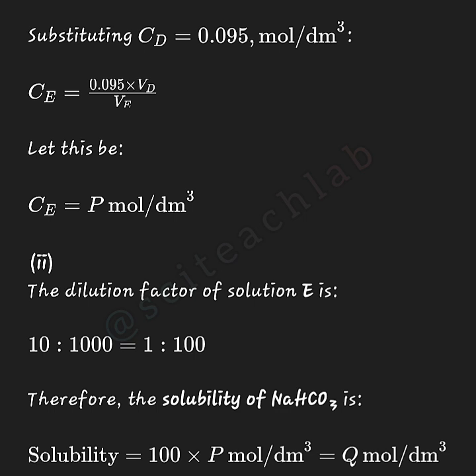Okay, your volume of acid from your average is going to be different, and the concentration may be different from the one you will use, but whatever you use, when you calculate your average, put that average where you are finding VD. And then the volume of the base depends on the pipette you used.